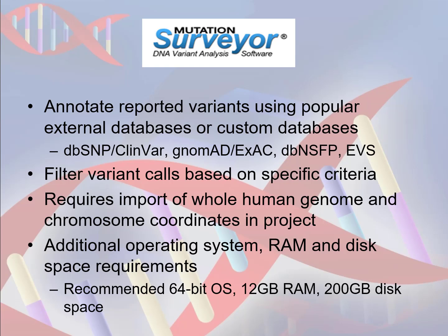Variant calls made in the project that are included in any of these databases can be annotated using the information provided by the database for reporting purposes. The tracks may also be used to filter variant calls. Calls can be filtered based on reported status, which can help for reporting novel variants, or can be filtered based upon certain criteria. For example, if wanting to report variant calls deemed pathogenic as reported by ClinVar.